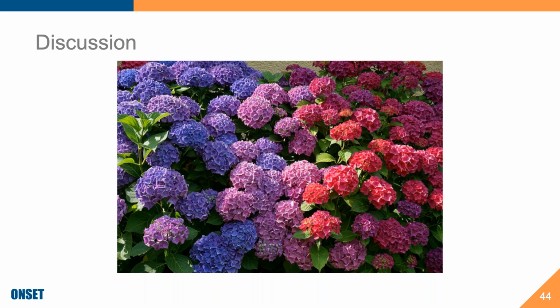And then if you absolutely want to keep it moist, distilled water even isn't that great because it'll dehydrate. It will also pull out the salts from the electrolyte. So, I'm sorry, it'll pull the water into the electrolyte and change the concentration of the salts. So it's really important to do everything that you can to put it into a salty, acidic solution. I'll let you decide. Coca-Cola might even be better than distilled water.